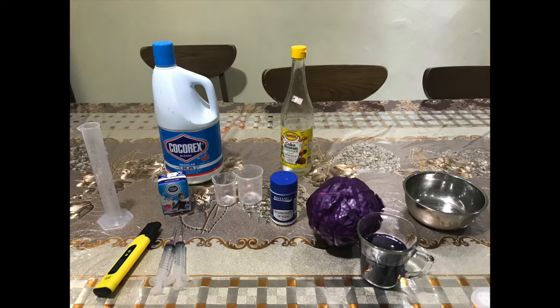The apparatus that I would use in this experiment are 50 ml of measuring cylinder, 2 beaker, 1 pH meter, 2 syringe. The chemicals used in this experiment are bleach, sodium bicarbonate, milk, and vinegar, and also red cabbage as indicator.